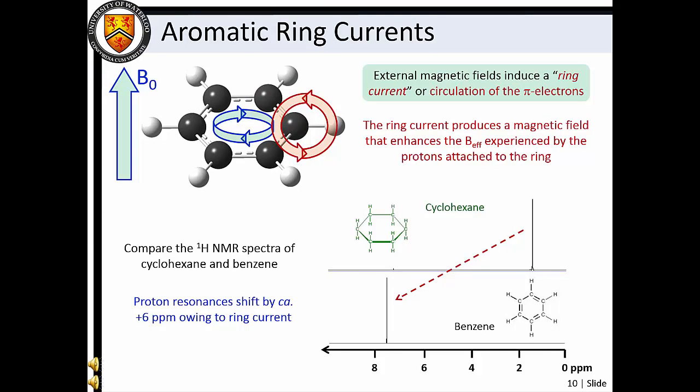Chemical shifts are not our only means of characterizing molecular structure in NMR spectroscopy. In Masterclass 14, we will discuss how adjacent magnetic environments can influence NMR resonances.